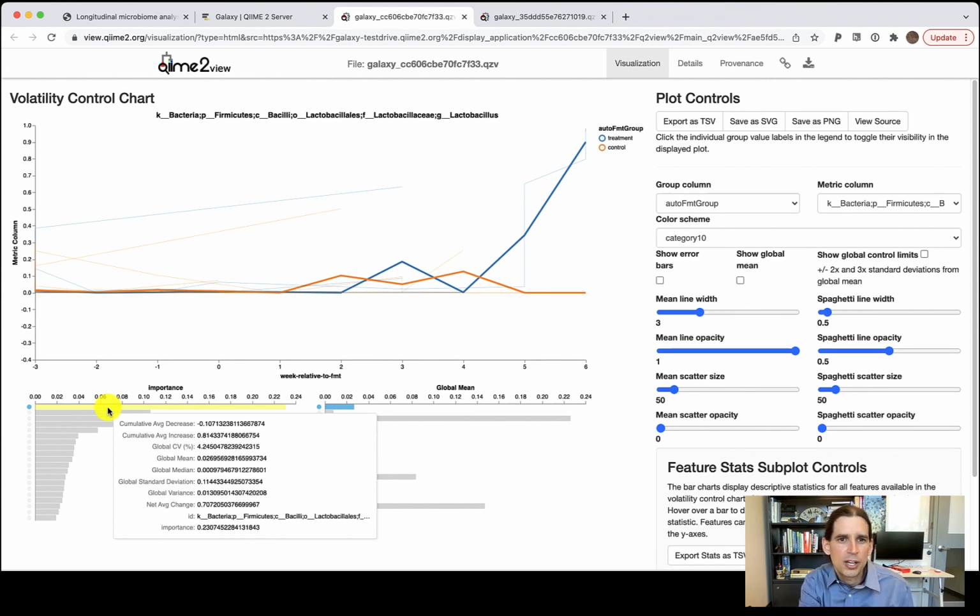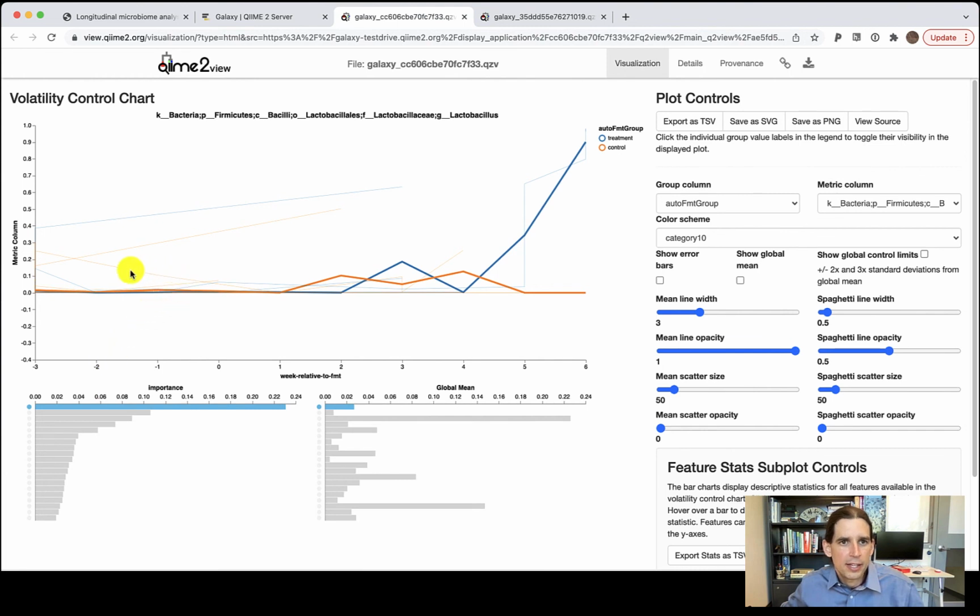Standard deviation, about 10%. And so you can see this is a low abundance feature that we're working with here. The difficulty of seeing that might also suggest why we want to do some filtering of low abundance organisms before generating these plots, just helpful for the visualization.